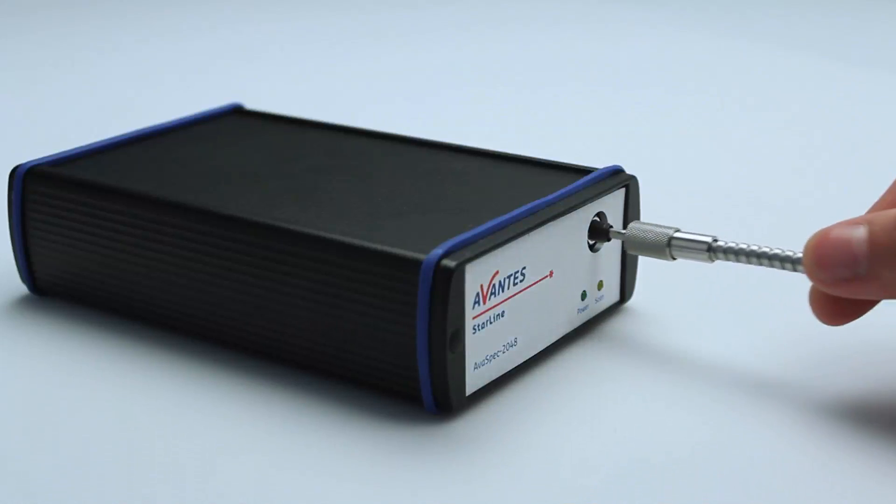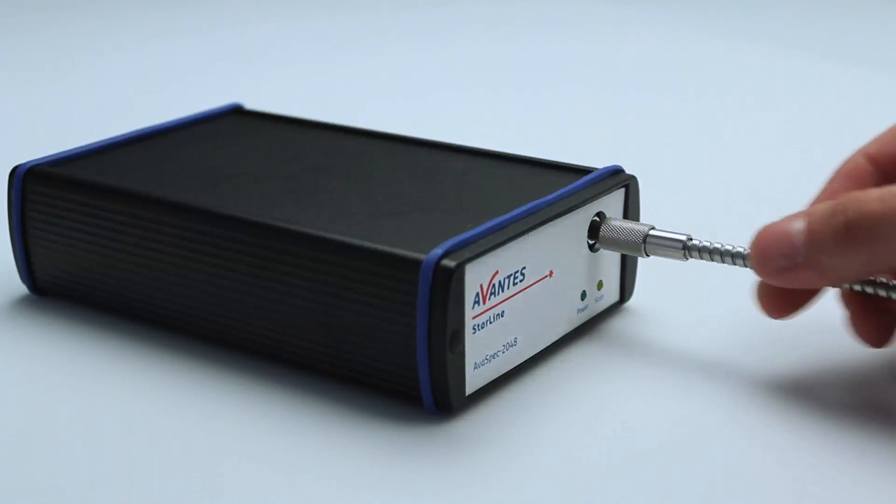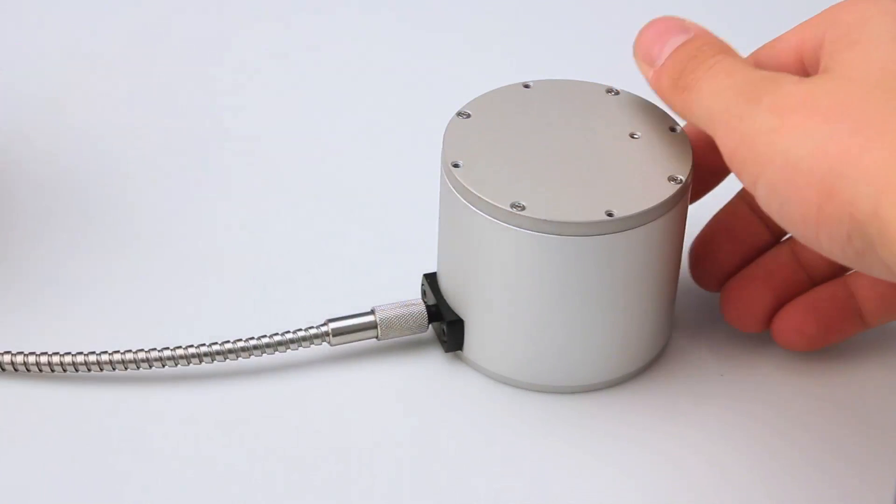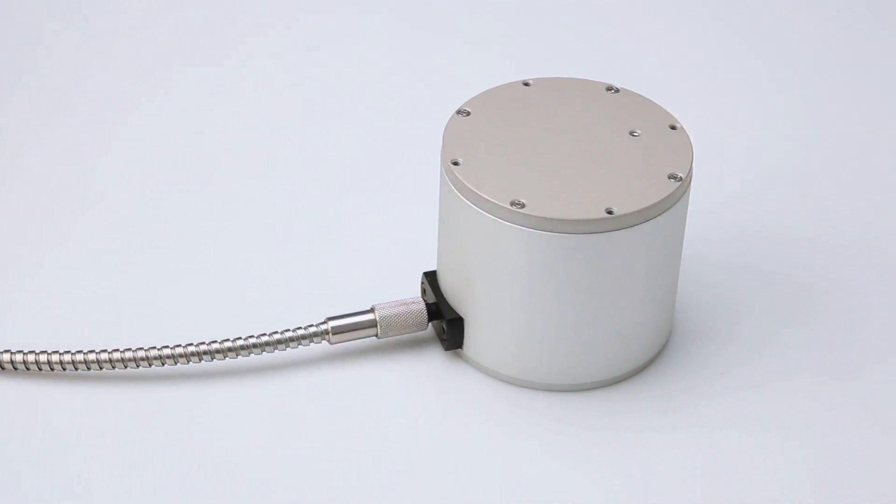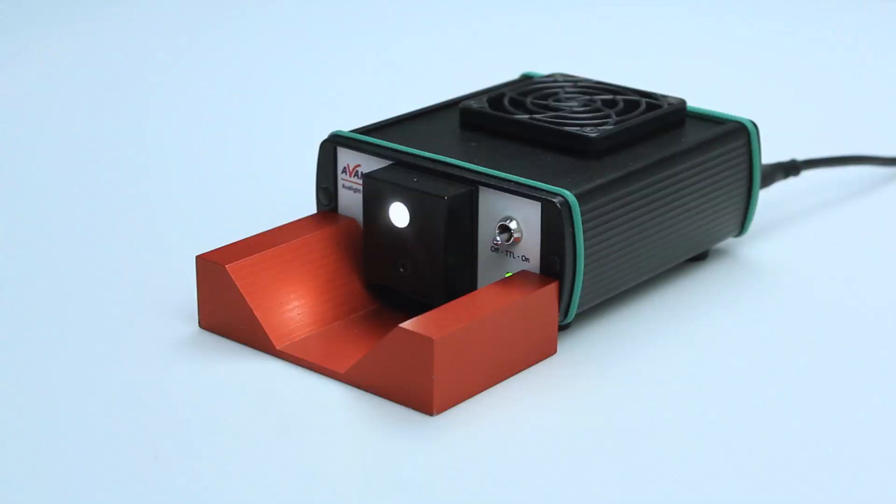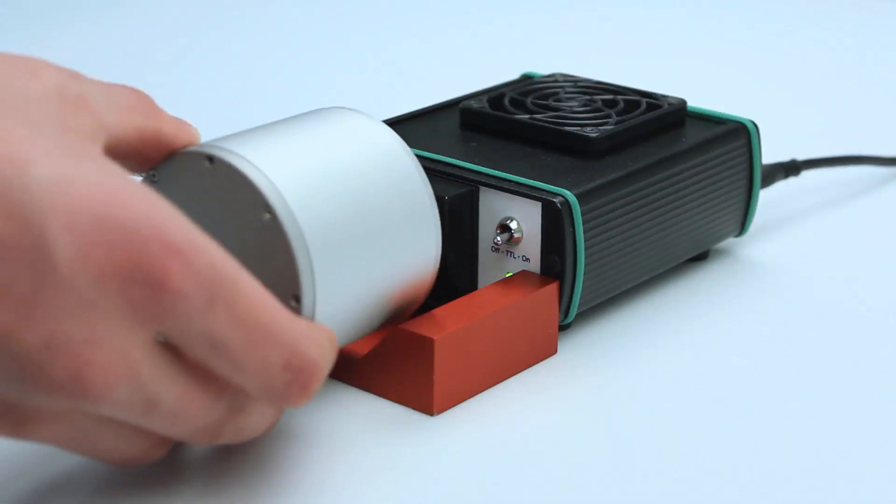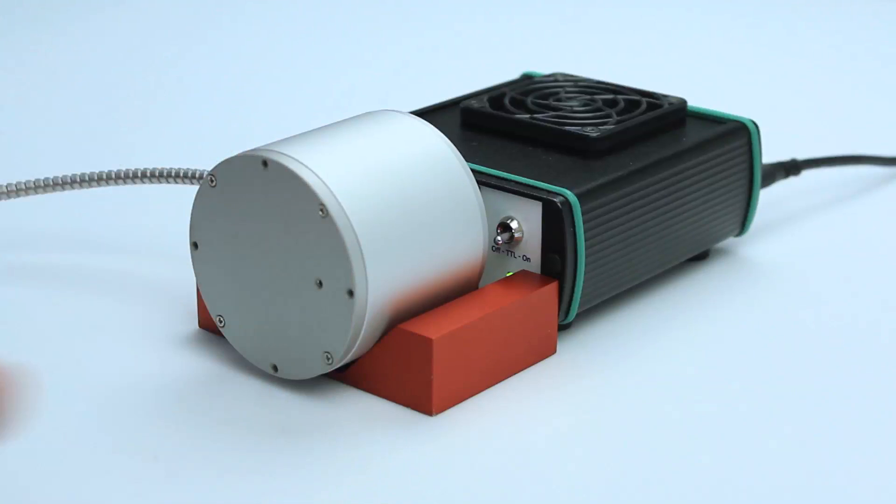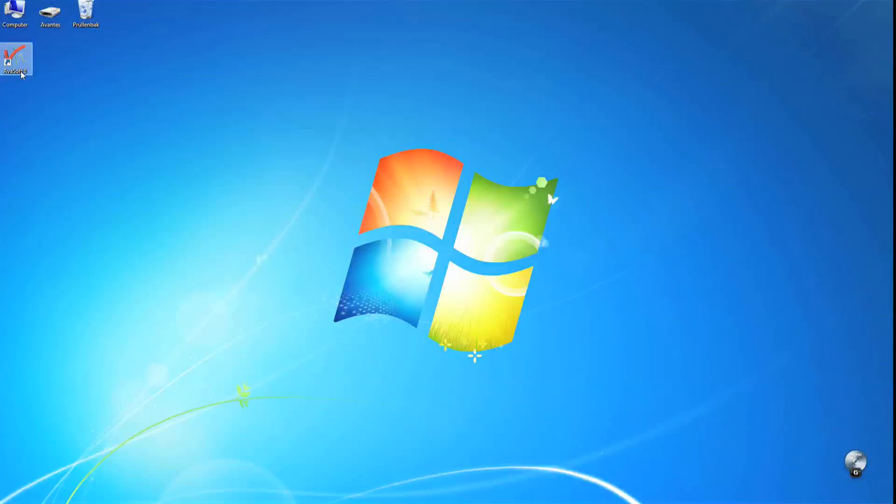Connect the spectrometer to the sphere. Now put the sphere in front of the Avantis halogen light source. Start up Avasoft 8.